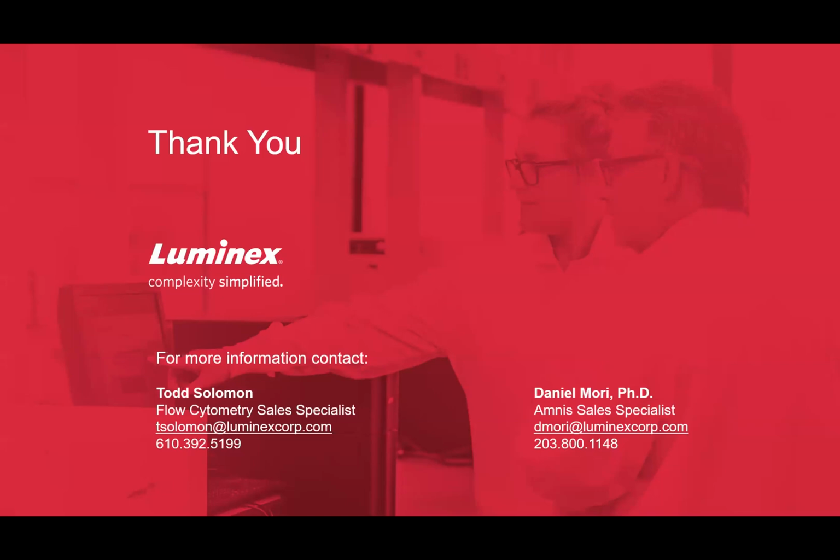Perfect. Now we have a question from Evan Jellison up in Connecticut, but I guess now Massachusetts. He's asking if the IDEAS machine learning module is cloud-based or is it installed on a local system? And if it's local, are there system requirements or recommendations?